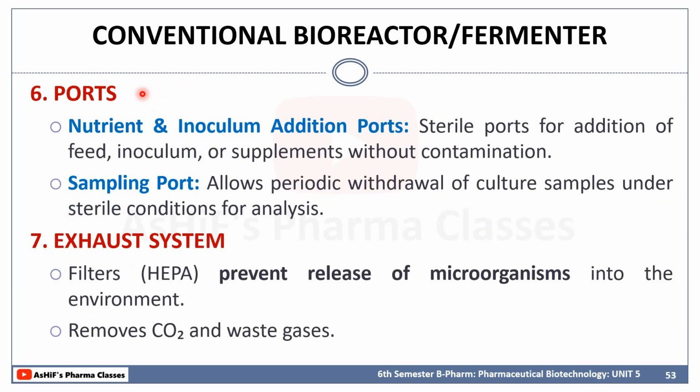Now coming to ports, there are ports to add and withdraw samples. We have a nutrient and inoculum addition port, through which we can add the feed, inoculum, and supplements sterilely, without any contamination.